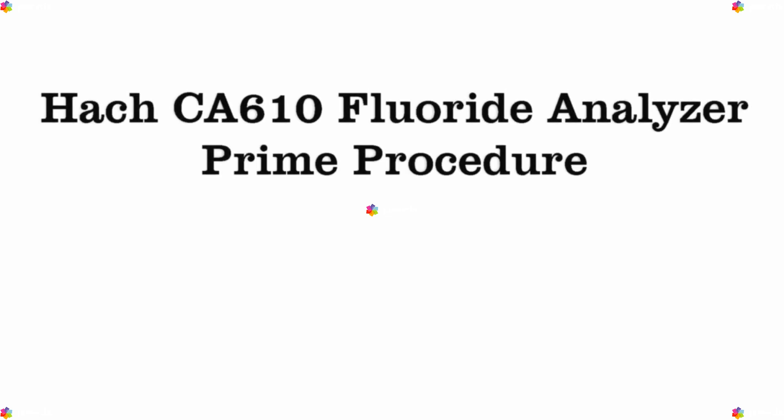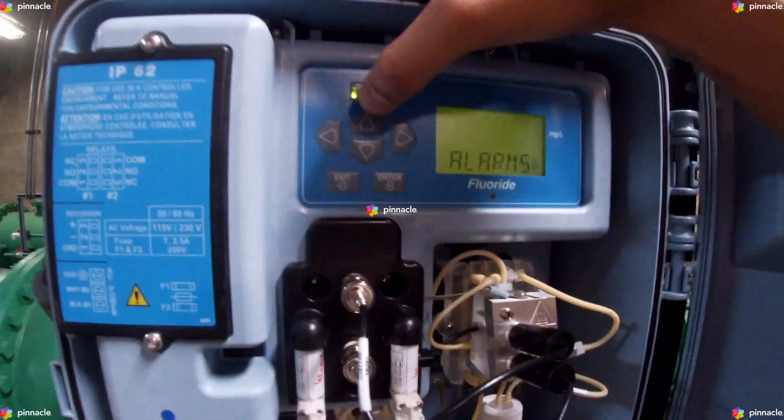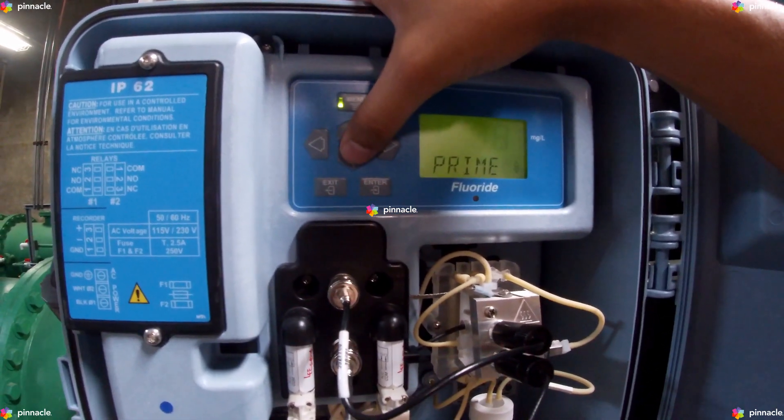This video will guide you through the steps for priming a HAWC CA610 Fluoride Analyzer. Let's get started. Begin by clicking on Menu, scrolling down to Prime, and pressing Enter.